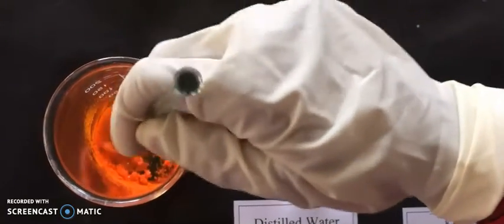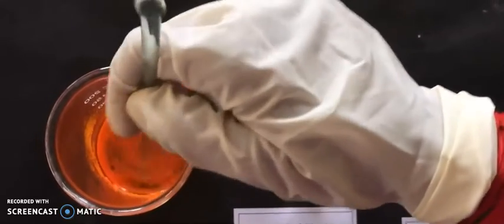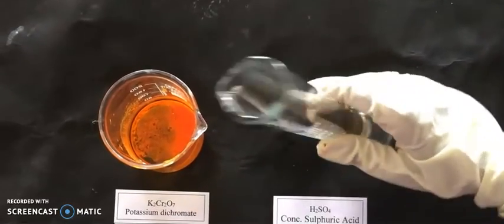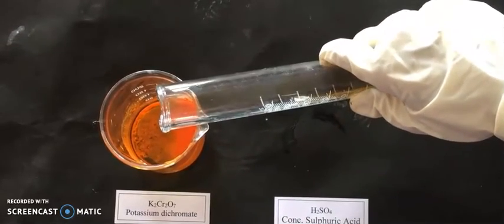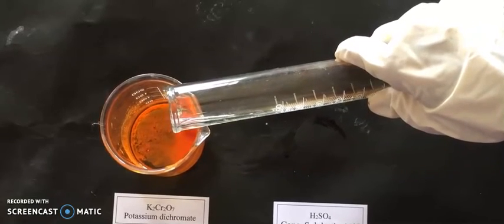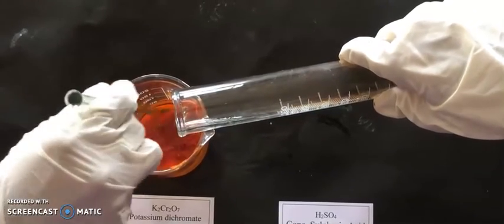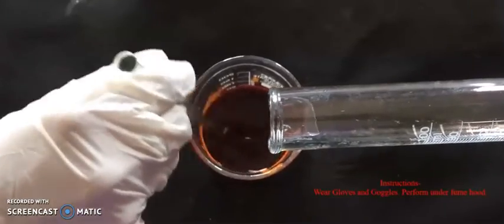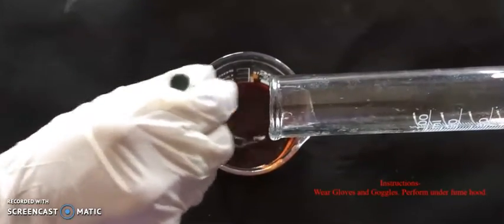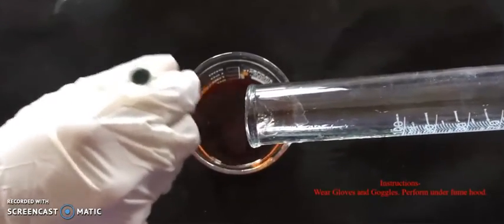Now make the paste with the help of a glass rod. Then you have to add 300 milliliter of sulfuric acid. After adding, you can see here a dark solution, and this dark solution is known as chromic acid.